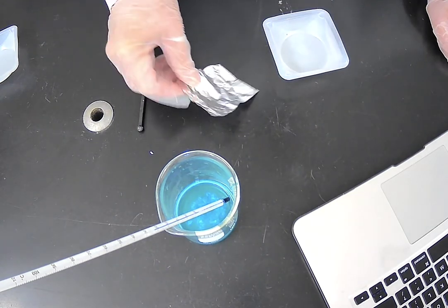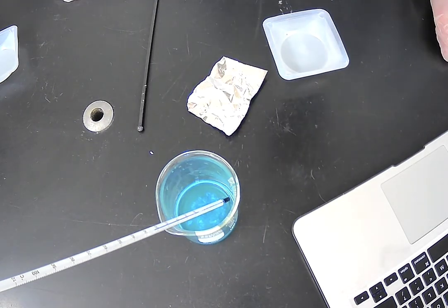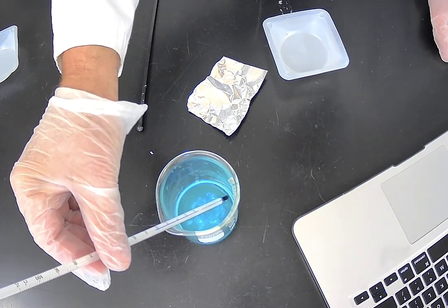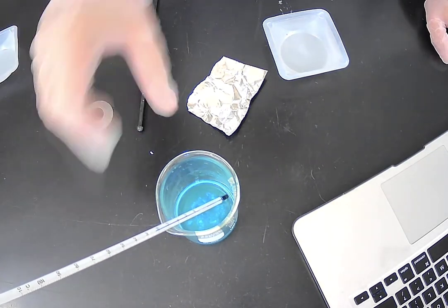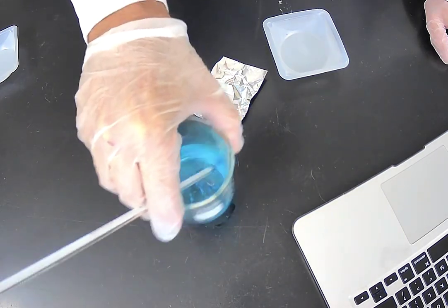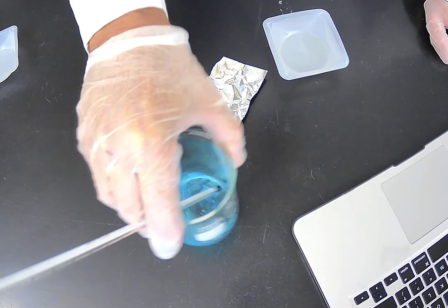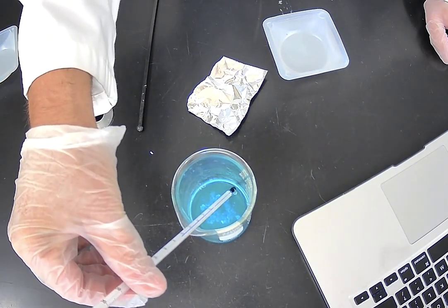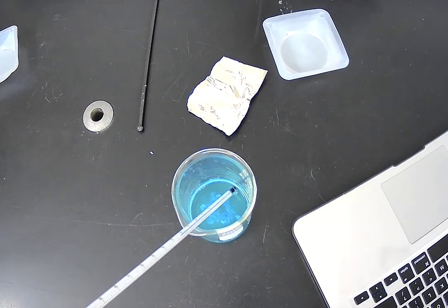Okay. So my initial temperature at time 0 is around 22 Celsius. Now that probably doesn't make a whole lot of sense to you because we use Fahrenheit, but I'll let you do the math on that one. I'm not going to convert it in my head to Fahrenheit. Let's see, that's 22 Celsius.